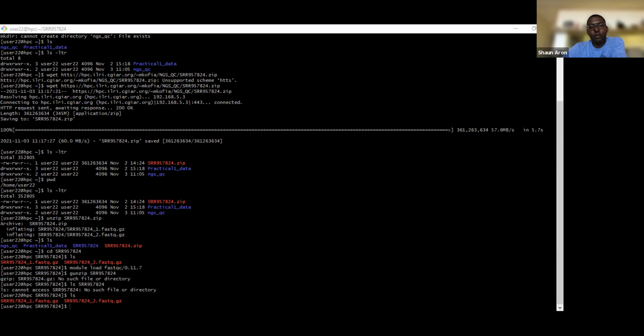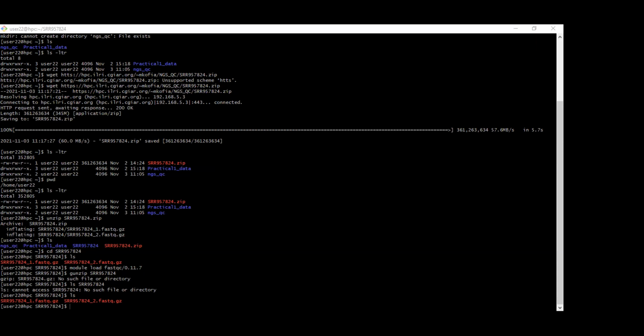Did you find it? It is still loading. Let me find it offline. Yeah, it's on page 3. You could also download the document and view it on your machine. So I didn't access the second page; I thought there was only one page here. Yeah, so the next stage is this. Here it is, zcat. Okay, thank you so much.